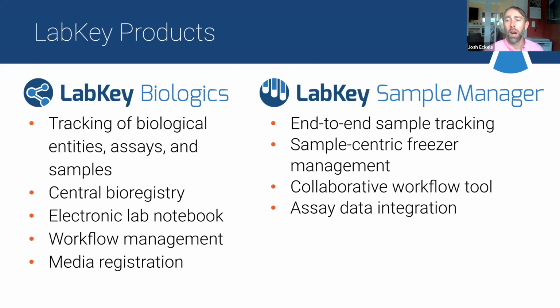Then the other side is work we're doing on Sample Manager to do end-to-end sample tracking. So that's the full kind of chain of custody tracking. It's really a sample-centric approach to freezer management, being able to see the history of a sample and where it's been in storage and things like that. And as well, having a lot of those workflow tools and being able to pull in assay data around that, including being able to link to mass spec data stored in Panorama.